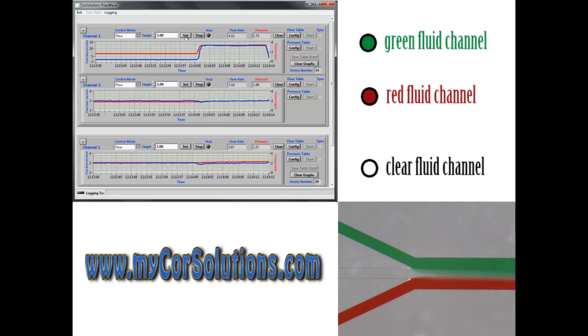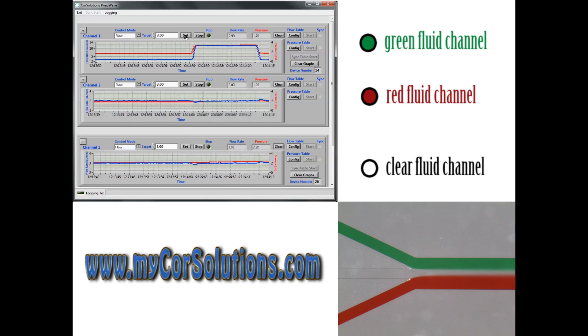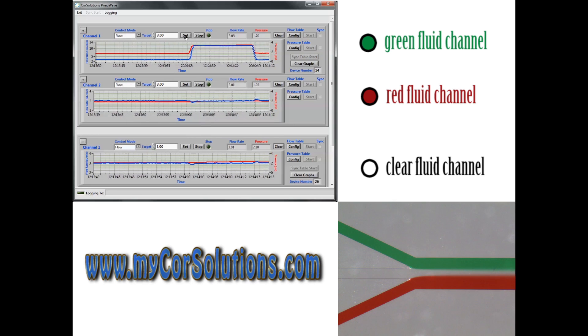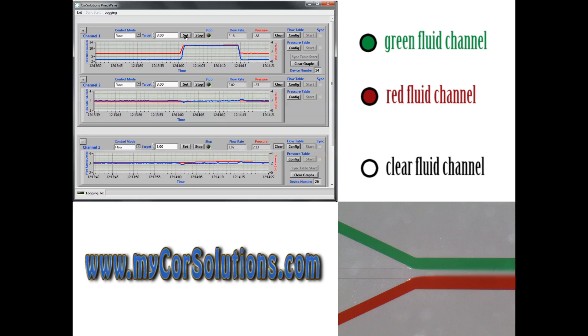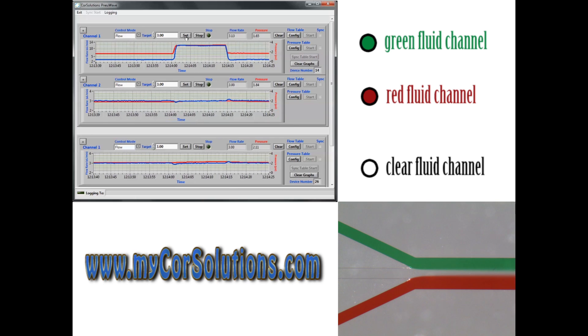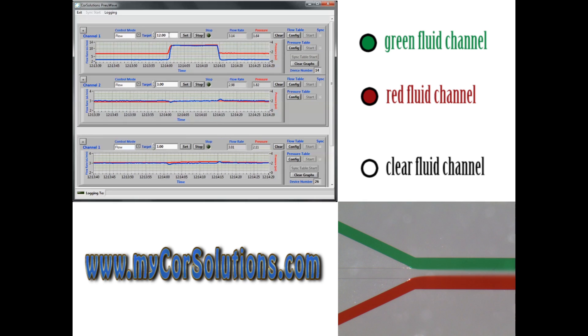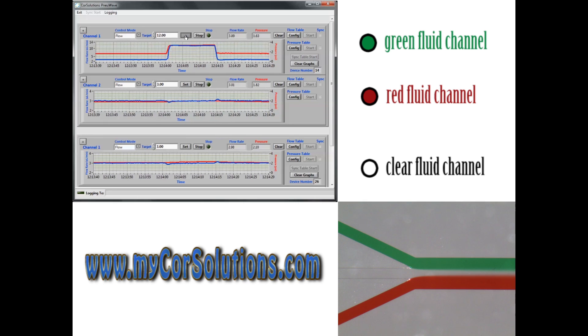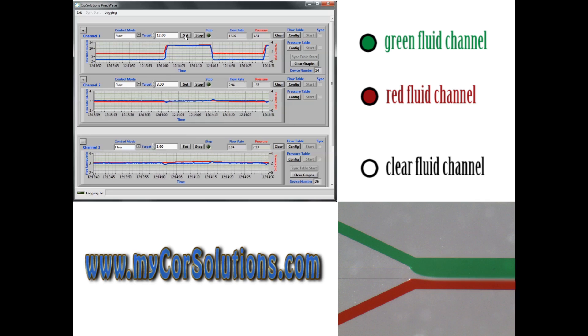Here fluid delivery in all three channels is controlled by flow rate with closed loop feedback control. To start, all channels are flowing at 3 microliters per minute. Then the flow rate of the green liquid is increased to 12 microliters per minute, while the other two channels are maintained at 3 microliters per minute.